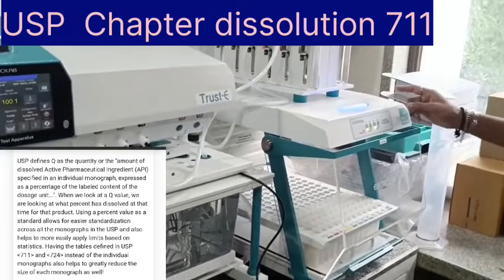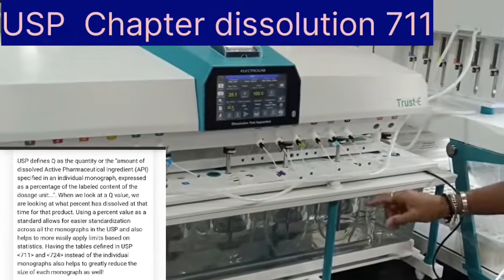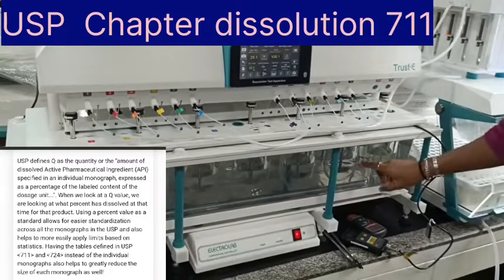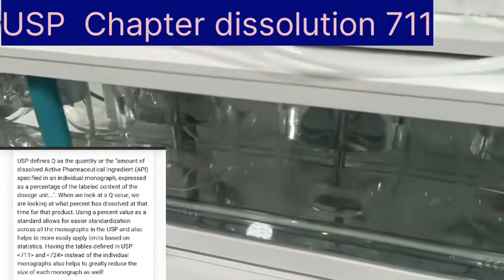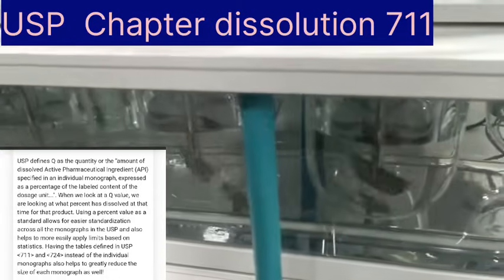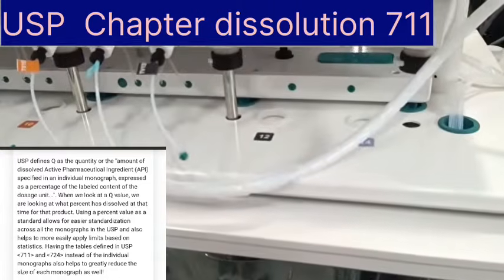We do not have dissolution data on 12 units. When starting with the smaller sample size of N equal to 6, we need tighter criteria, since you don't have as much statistical confidence. As we increase the sample data set, say N equal to 12, especially at S2 stage, we get closer to using the Q since you gain more confidence in your data. So we add extra margin because of the lack of statistical confidence at the S1 stage with 6 units.